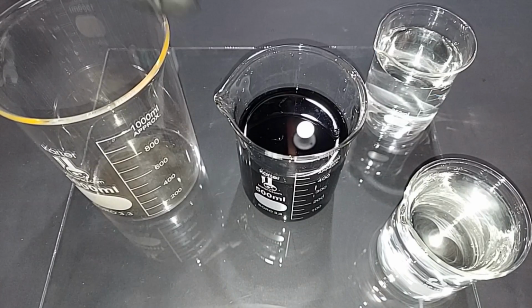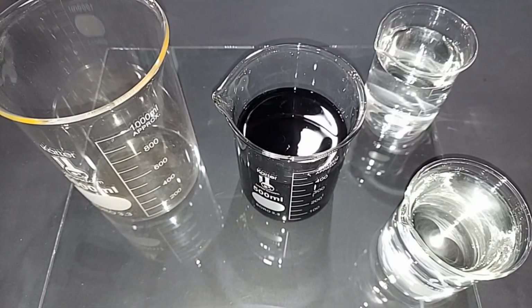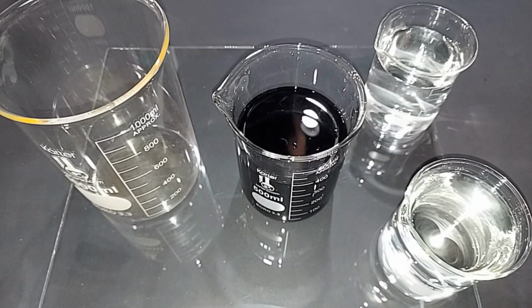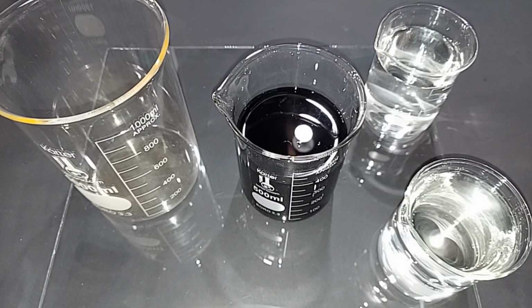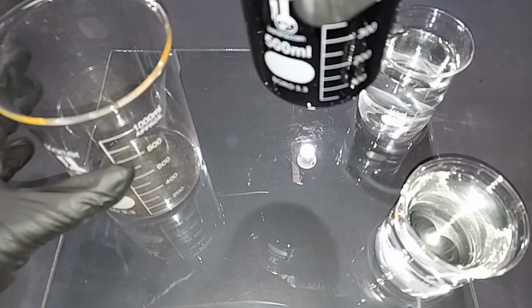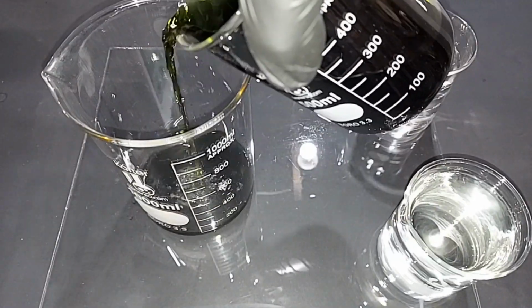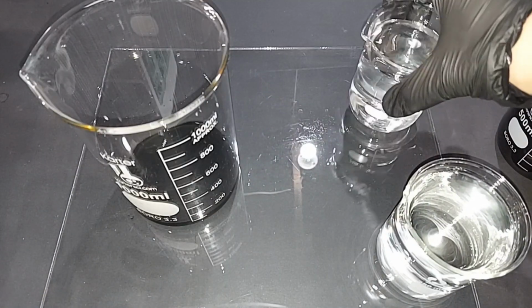So I let this sit here and nothing happened. And I kind of knew it wouldn't, to be perfectly honest, because it was still too dark, but I ran out of room on the top, so I couldn't pour any more water in. So I removed a little bit because I actually spilled it when I moved it last time. So I'm going to pour maybe 100 milliliters in this large beaker here. And now let's really drop those chlorine levels quickly.